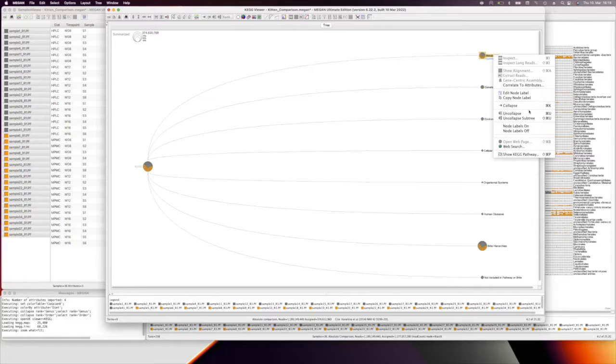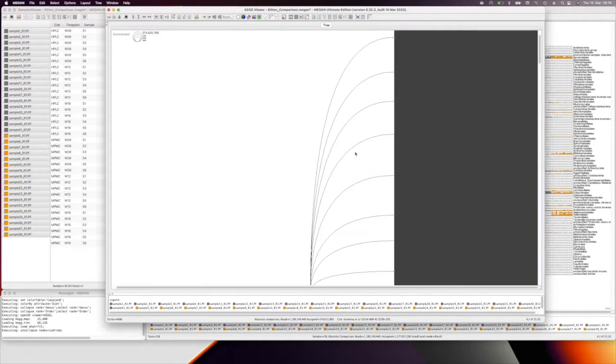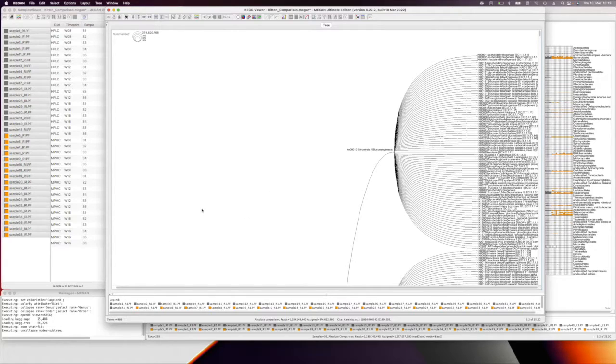So on the very right-hand side, we now have individual enzymes, and those enzymes always start with this K number, and they nest in biochemical pathways. This one here with this KO number is glycolysis, and then those pathways again are nested in pathway groups like carbohydrate metabolism and then metabolism. So this is quite handy, again, if you want to calculate abundances on different levels.